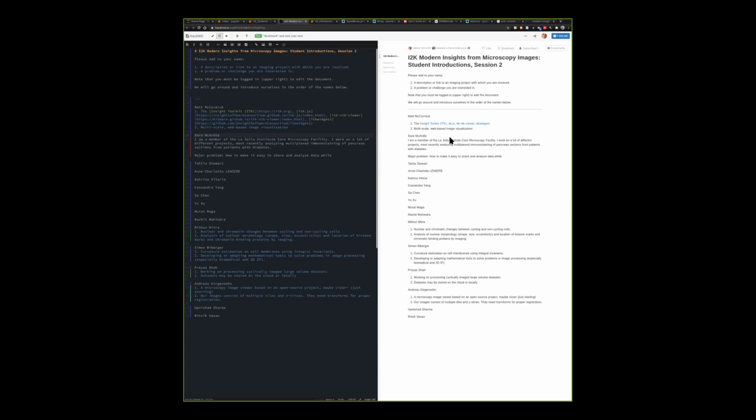Fantastic. What are you doing so far for that problem? We have an internal server that people can VPN into to get the data, and then VPN into some workstations, but it's really, really slow and really painful, and oftentimes it's easier to go into the building than deal with that, and that's not great right now. Definitely, now is the time to experience that.